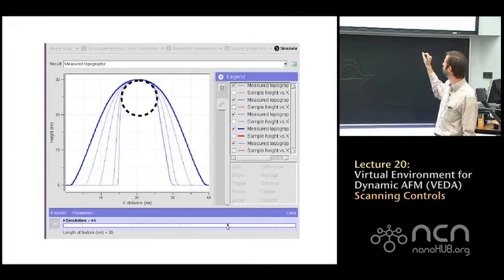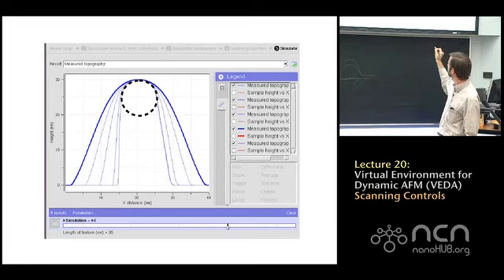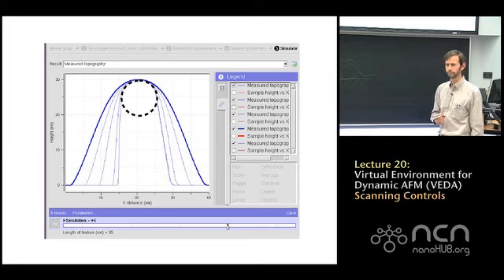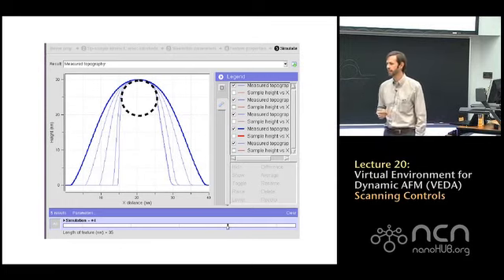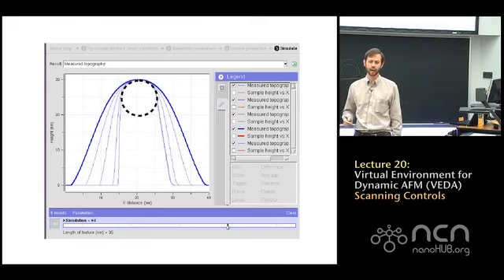For the smallest one at the top, it looks like a circle with a radius of 5 nanometers. So what this means is, instead of the tip imaging the feature, the feature is actually imaging our tip. Does that make sense? This is a very common problem in scanning, and in fact, you can go to the AFM supply places and buy samples that consist of little spikes that you can scan with the intention of figuring out what your tip looks like.